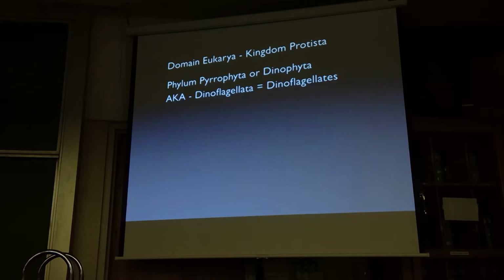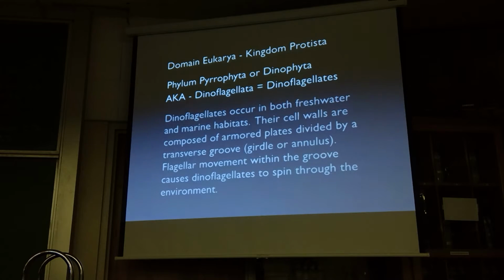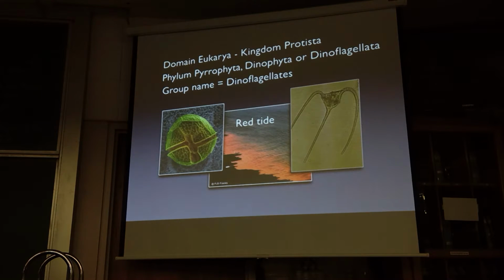The Dinoflagellata name is because these things were claimed by zoologists. They thought they were protozoa. They called them Dinoflagellata as opposed to Phyta. I'll accept any one of those names for that phylum. We have two specific examples. This is talking about, again, the central groove with that flagellum in the groove that causes them to spin. If you watch live ones, they constantly are spinning.